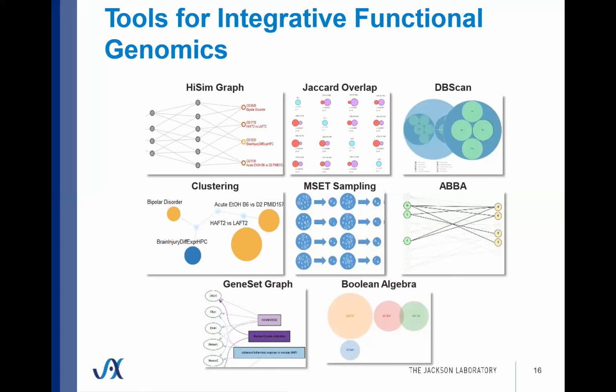So there was a time when you used another famous pathway resource where MYC would come up in all of your analyses, MYC, the transcription factor, and it's because it's connected to everything, and it is thus the glue that unites everything in every data set. And you're like, wow, how exciting, my gene set's connected to everything else through this one regulatory feature. We have looked at weighting by representation and things of that nature.